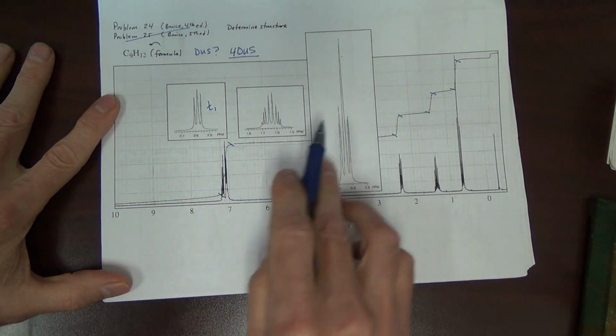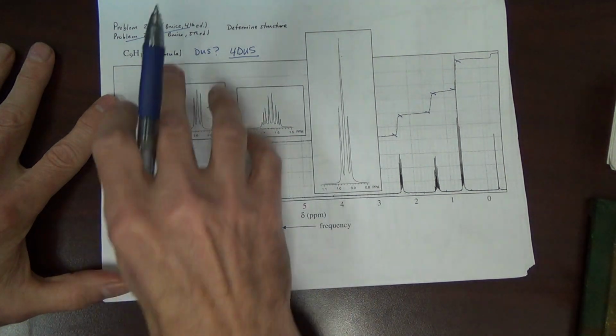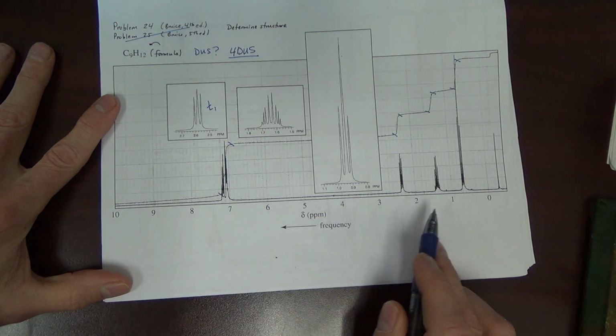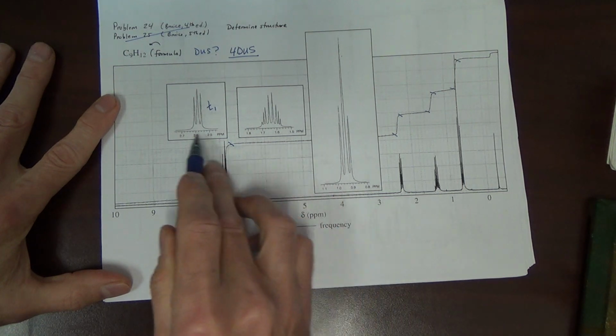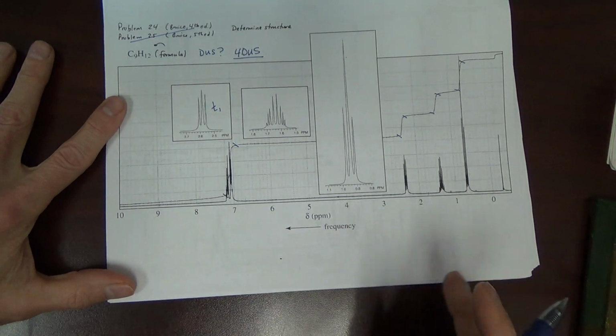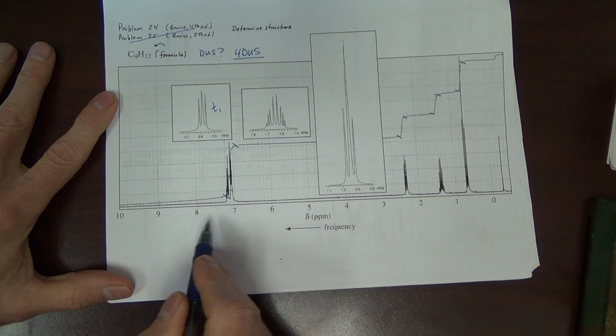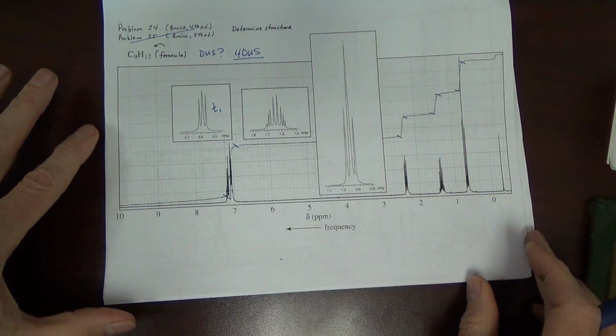Okay, I may have mentioned this at the end of video 3 when we sort of introduced this NMR here, this practice problem. We can see the baseline for the expanded peaks. Okay, I would start right here. I see peaks here in the 7 to 8 region.